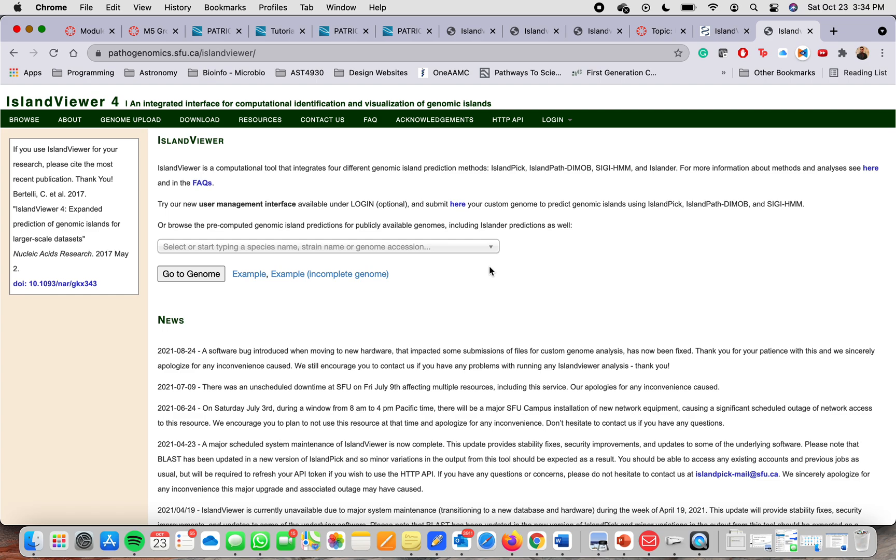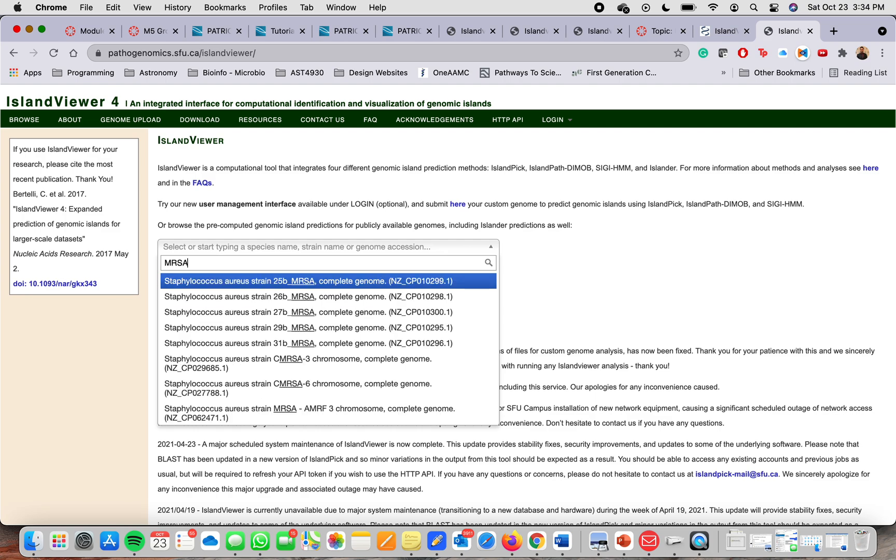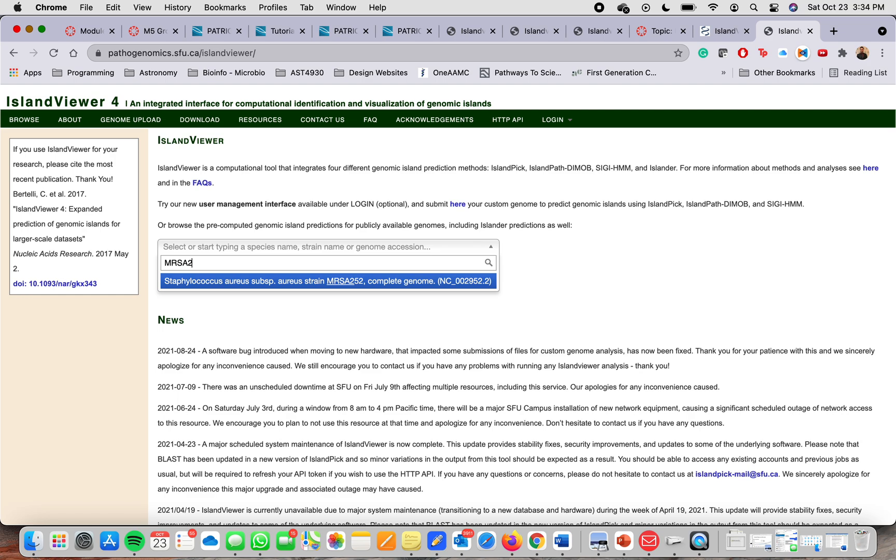So this is the main website of Island Viewer 4. If you're looking for a specific organism for the genome, what you can do is you can quickly type the name here. The first one that we will use is MRSA 252 and it will pop up right there.